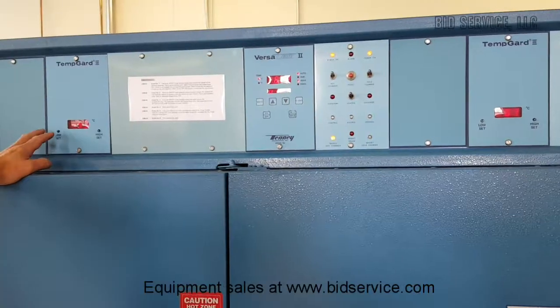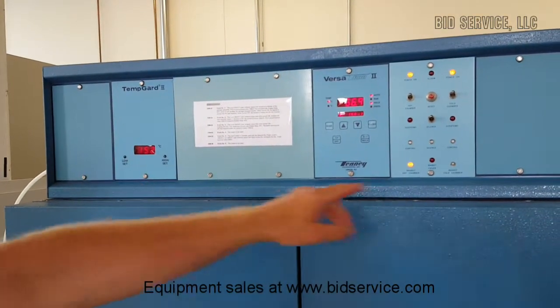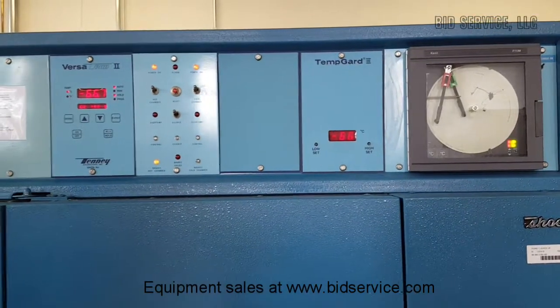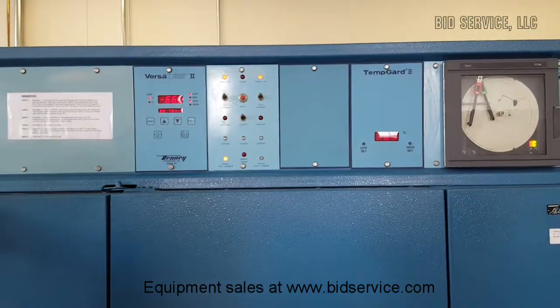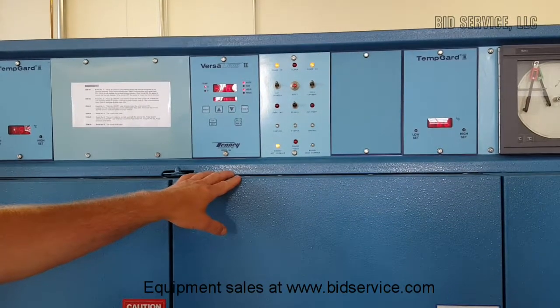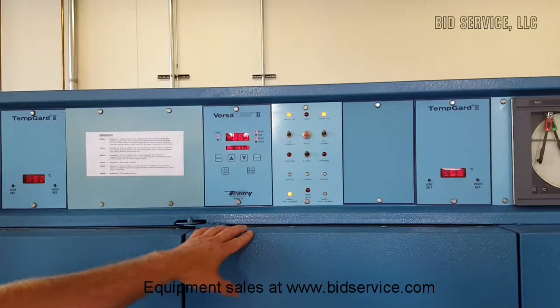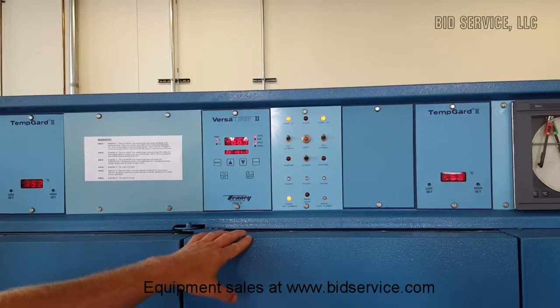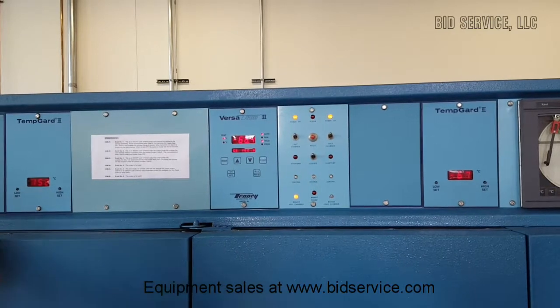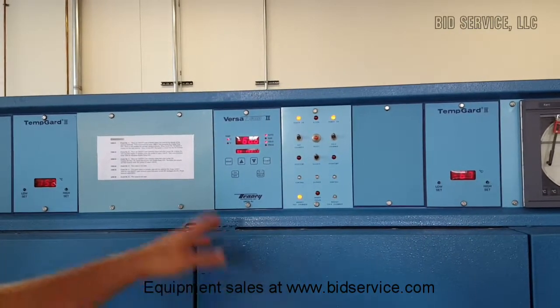You can see the chamber is at operating temperature of 152 on the hot side, minus 67 on the cold side. The chambers can be run independently and you could program the cold chamber to go minus 65 to 200 and run it independently with ramp programs, or you can program it as a thermal shock where you transfer the basket from hot to cold or vice versa.